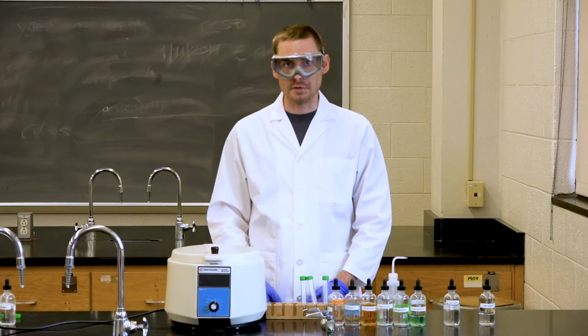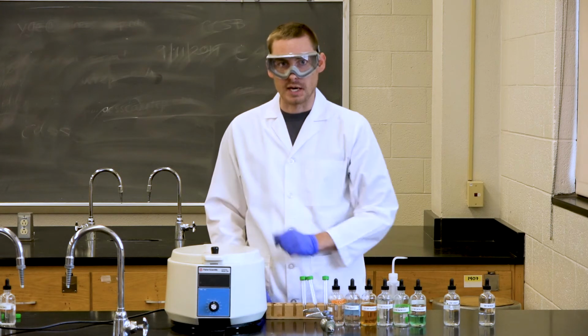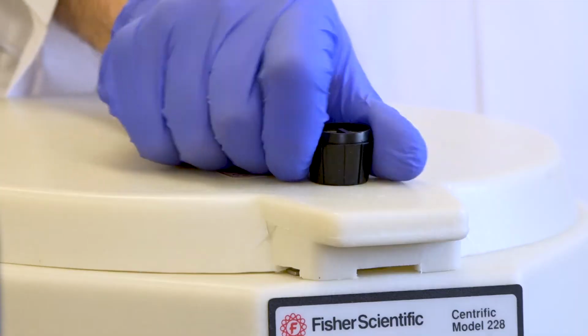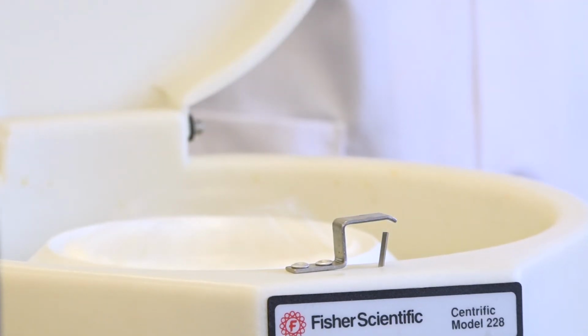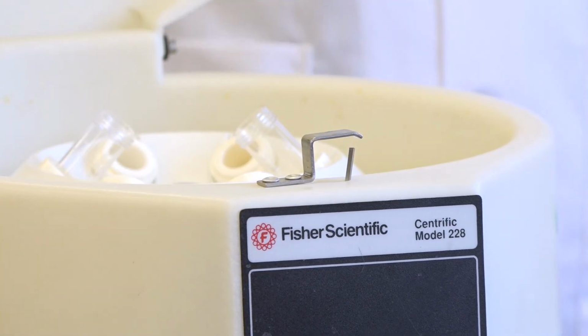So to stop the centrifuge, you can turn the dial to off, which will stop the timer. You want to make sure that you don't open this until it has stopped on its own. If you do open it and put your finger in there, you might hurt yourself. So now that it's stopped, we can open the centrifuge and remove our samples.